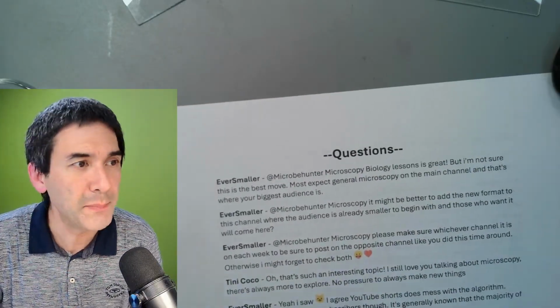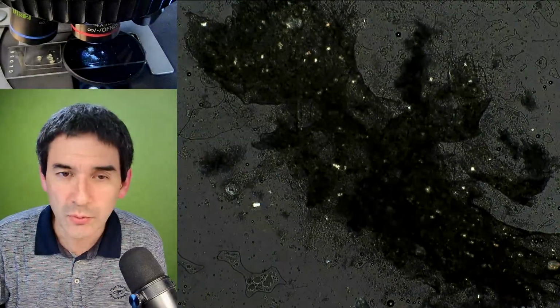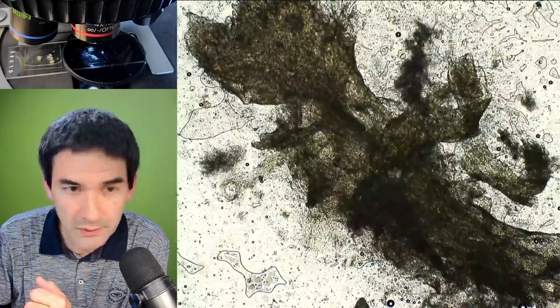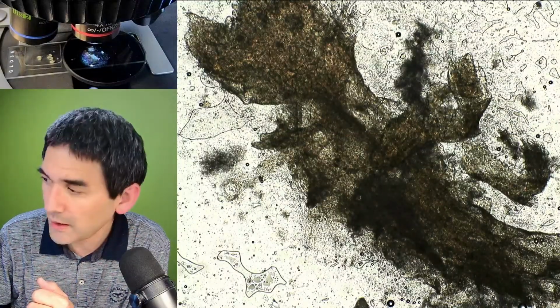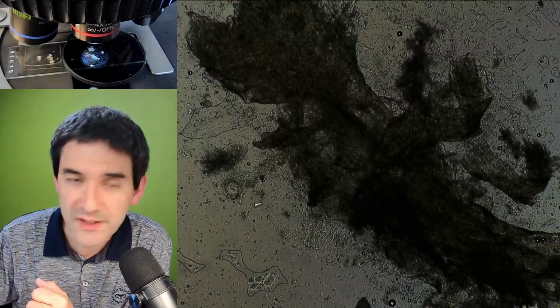Okay. What happens if you put DIC back in place? I have no idea, so let me see. So that's not polarization. What I'm going to do now is put in the one on the bottom, and I'm going to put in the one on the top. It still polarizes.